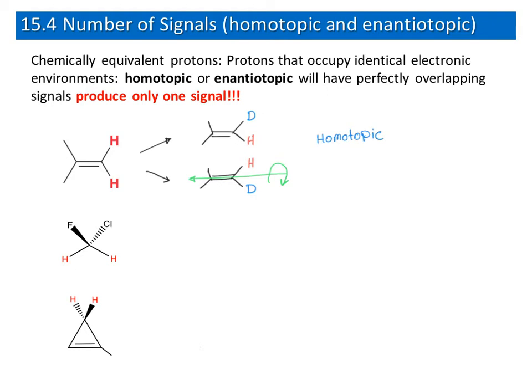Now let's look at the next structure. Again, we can do the replacement test. I replace each proton with deuterium.